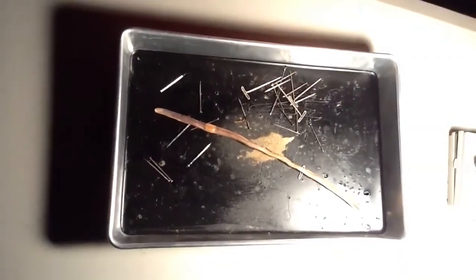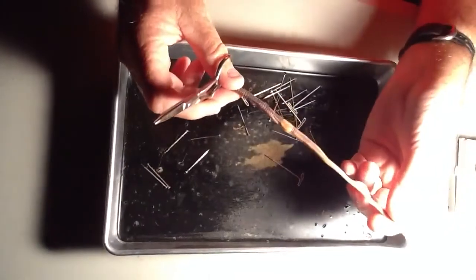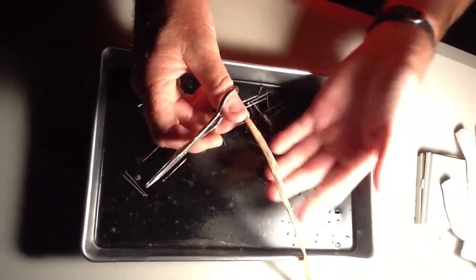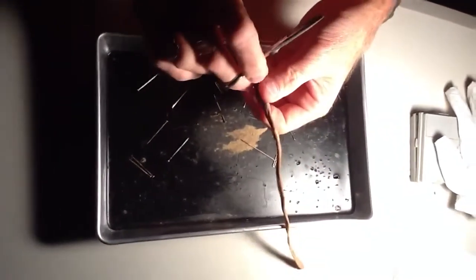So the way I'm going to do it, start with the head. The dark side is up. They have counter shading, like we talked about in the evolution unit. They have a light on the bottom. Not that anything underneath an earthworm is going to go, ooh, it's really light up there. But that's the way they are.